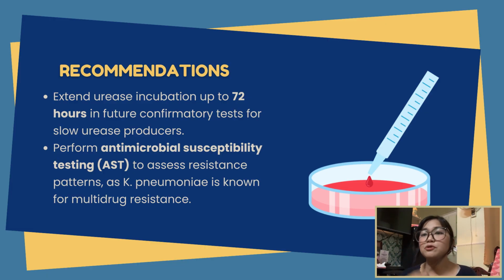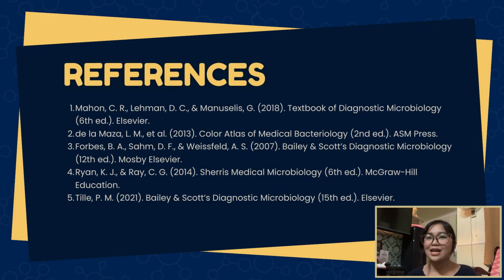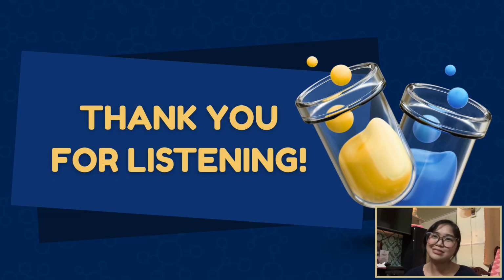Then second is to perform antibiotic susceptibility testing, since Klebsiella pneumoniae is known to be multi-drug resistant. Now these two are the things I wasn't able to perform due to limited time and resources last week. Now, once again, the bacteria identified is Klebsiella pneumoniae.